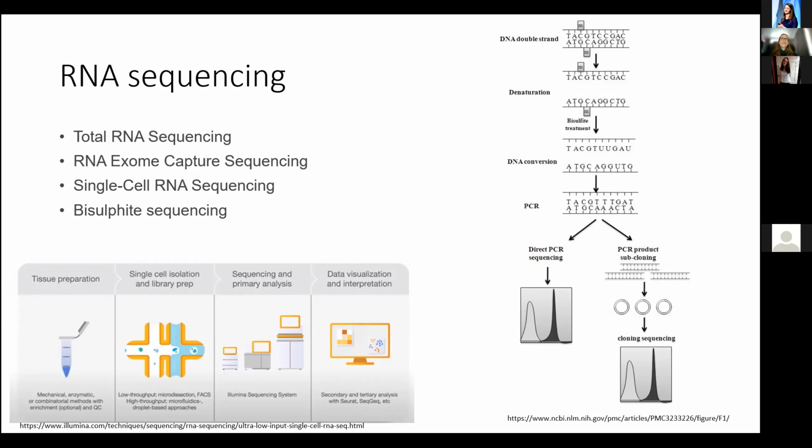can be very varied. Another interesting approach is bisulfite sequencing. That is a method used for research in epigenetics. It's based on the fact that DNA methylation is an epigenetic mark and is implicated in repression of transcriptional activity.